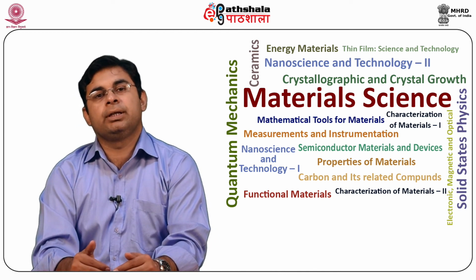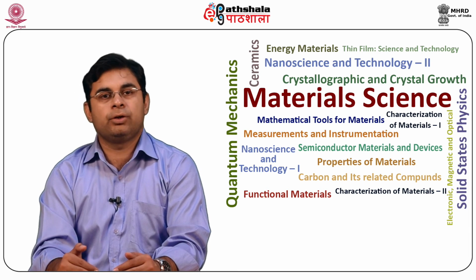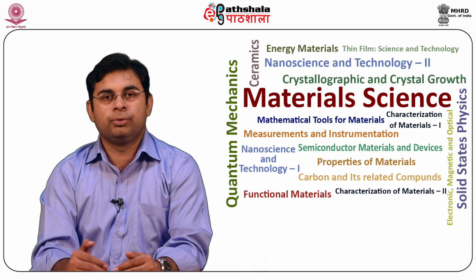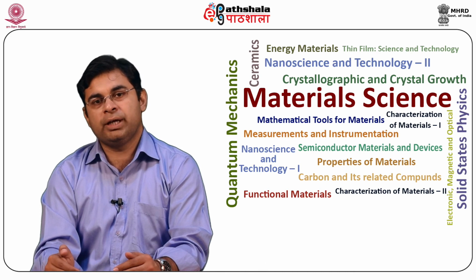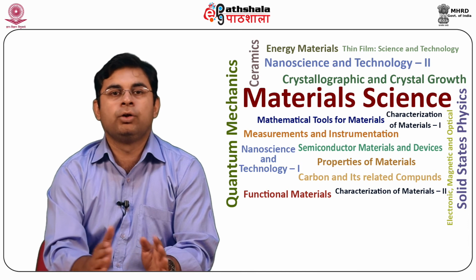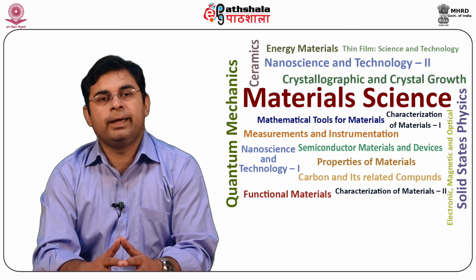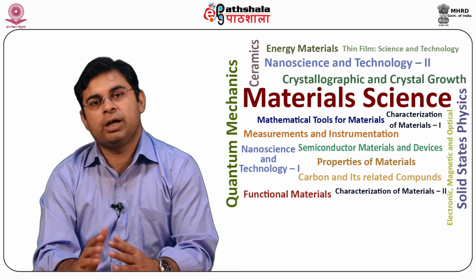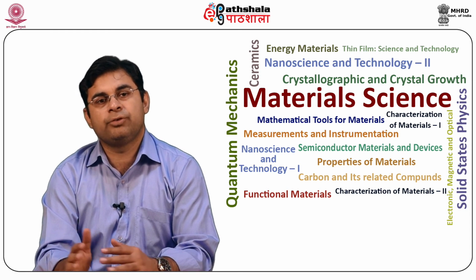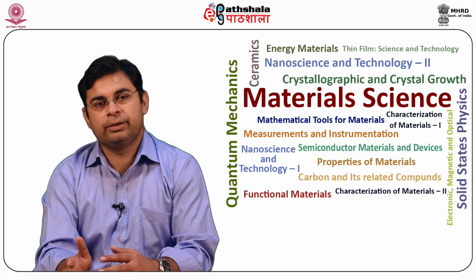Cantilevers typically range from 100 to 200 microns in length, 10 to 40 microns in width, and 0.3 to 2 microns in thickness. Integrated cantilevers are usually made from silicon crystals or silicon nitride.